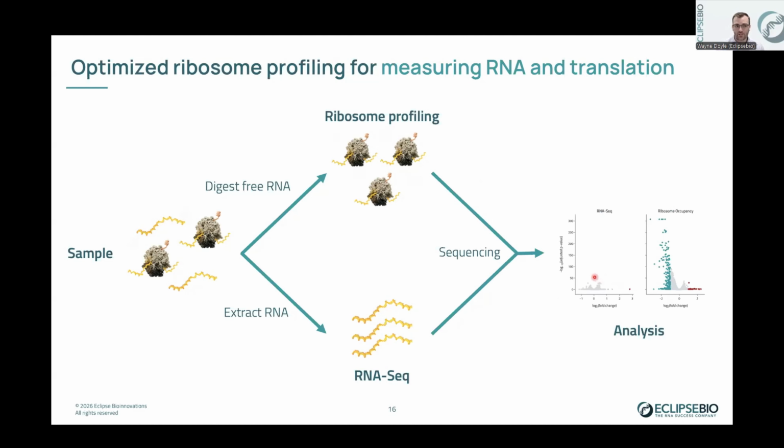Each dot is an individual gene. And then the left is changes in RNA-seq, so the changes in the actual gene expression. This is a translation-specific drug, so we see no changes in the actual expression. We do see strong suppression as shown by the colored blue dots when this drug is present at a significant level. But I'm going to focus more on a refined analysis where we actually look at where ribosomes pause.